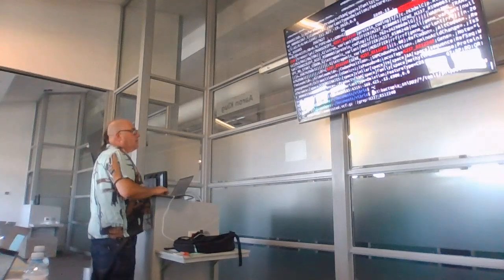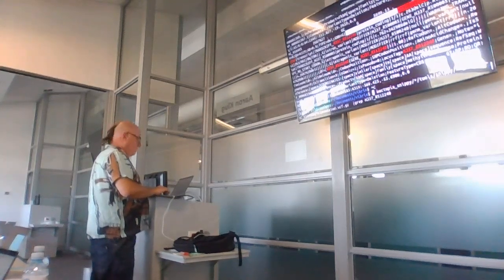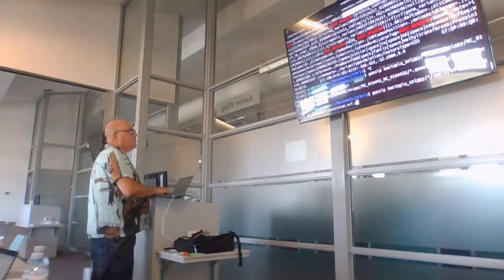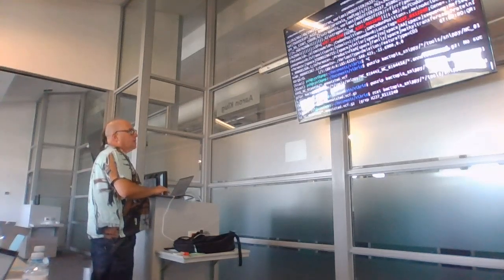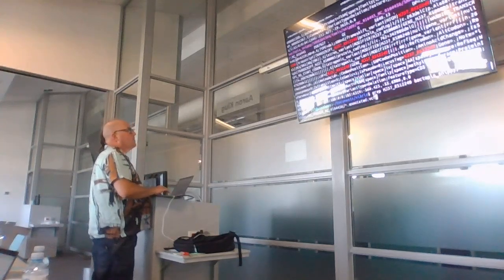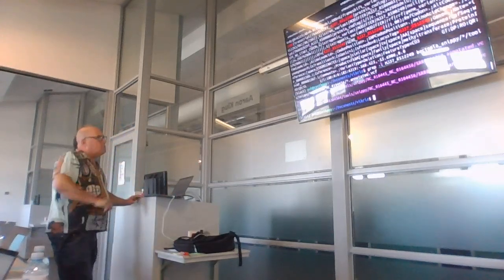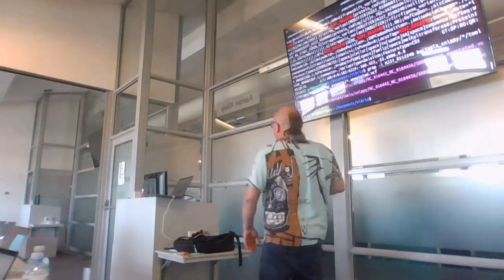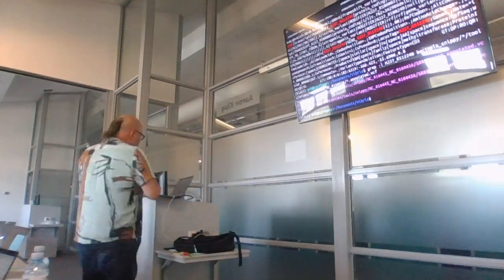So I'm just going to unzip, just for myself, just so that it makes my life easier. I'm going to unzip all of these VCF.gz's so that I can now do my grep a little bit differently. It's going to give the same result at first. Now I'm going to say grep -l to see which files I find it in. So in these two files, 260 and 364, okay, I see a shift.